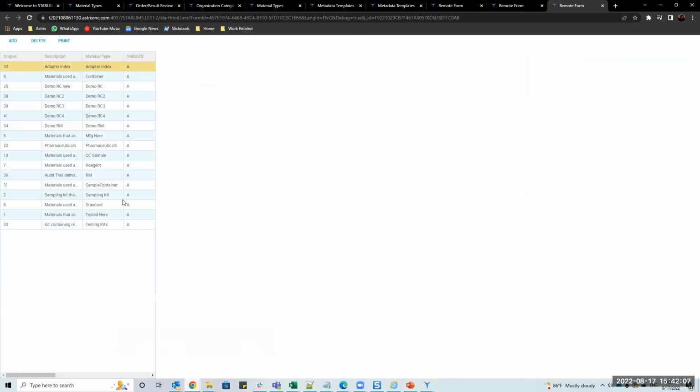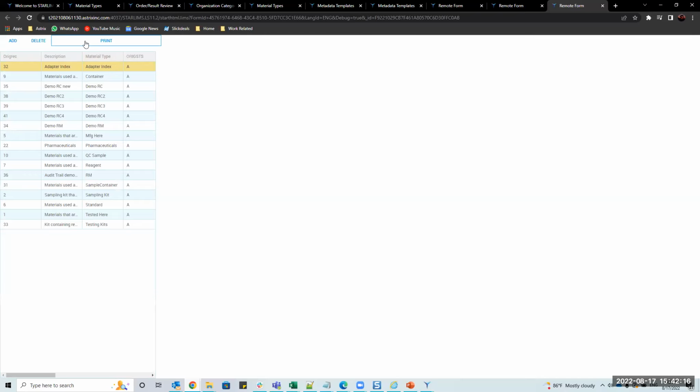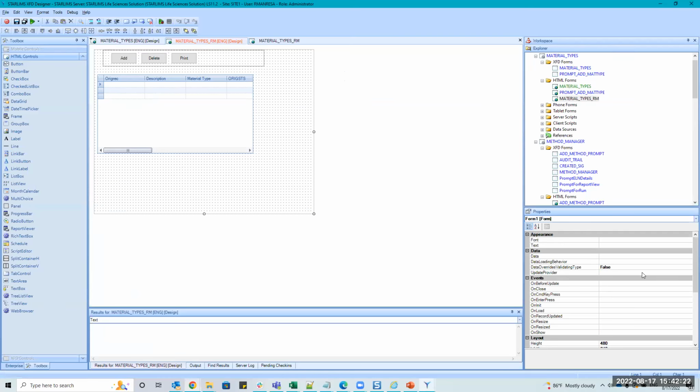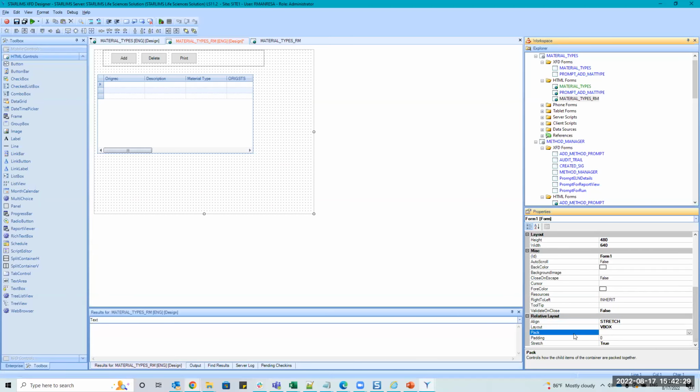Let's run. So I just do this, refresh, which is not what you want because you don't want a button to look like that, but there's the button. And it's actually not going all the way to the end. I have an issue here where both of them are stopping here. Let me see if I can figure out why. We have maybe stretch on the form itself. Because I have stretch here, and then I have a V box. And yeah, I'm not sure.